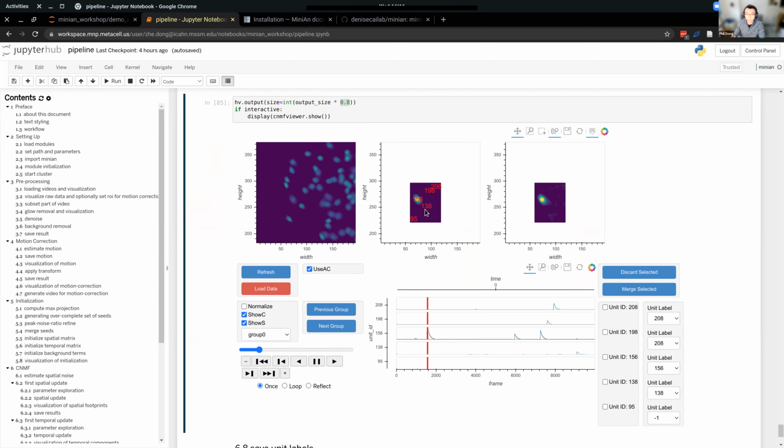The middle panel no longer shows the spatial footprints all the time. It becomes a tiny little window that changes based on time. When this cell is not firing, it's supposed to be dark, but I don't know what's going on. It's very slow.